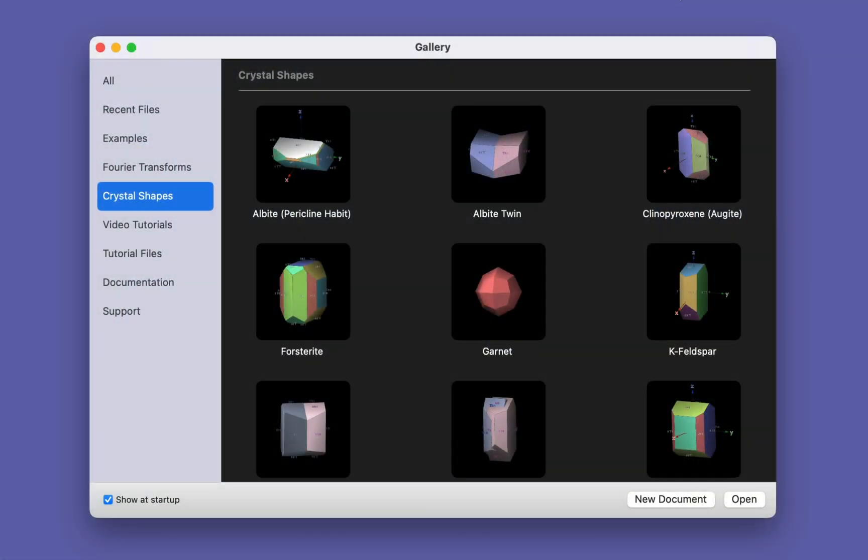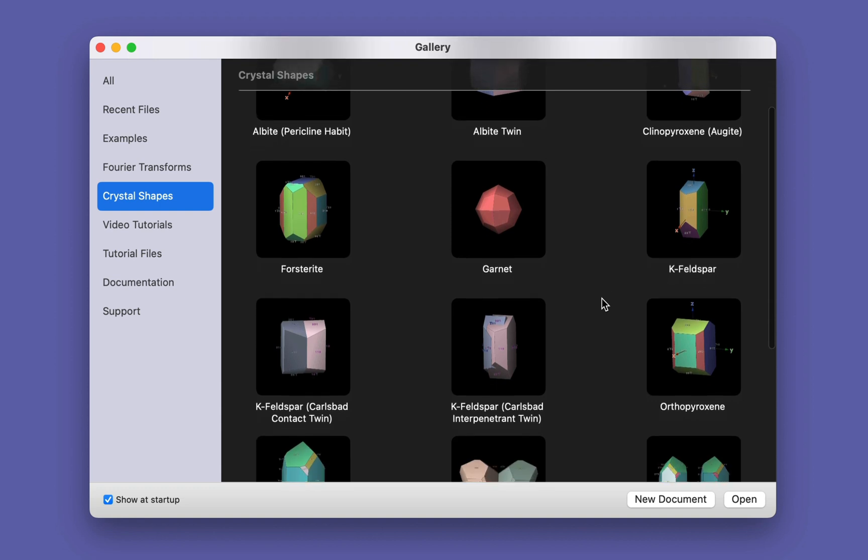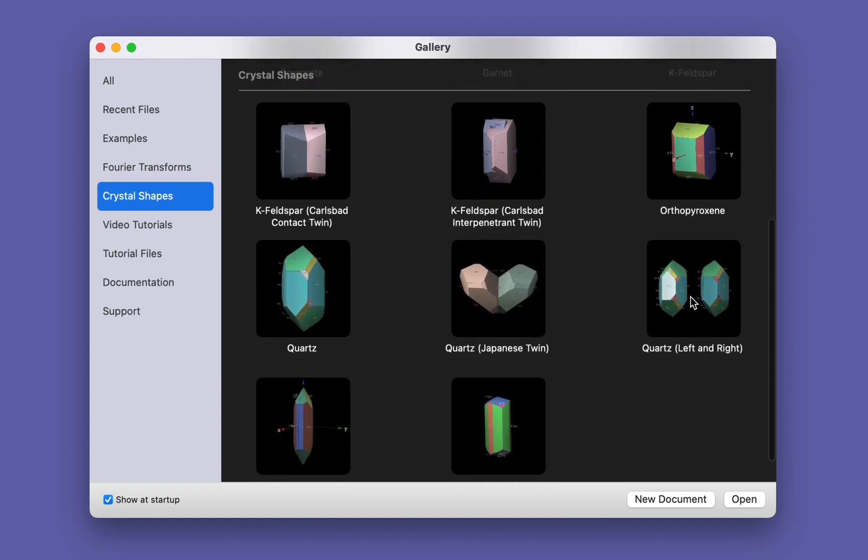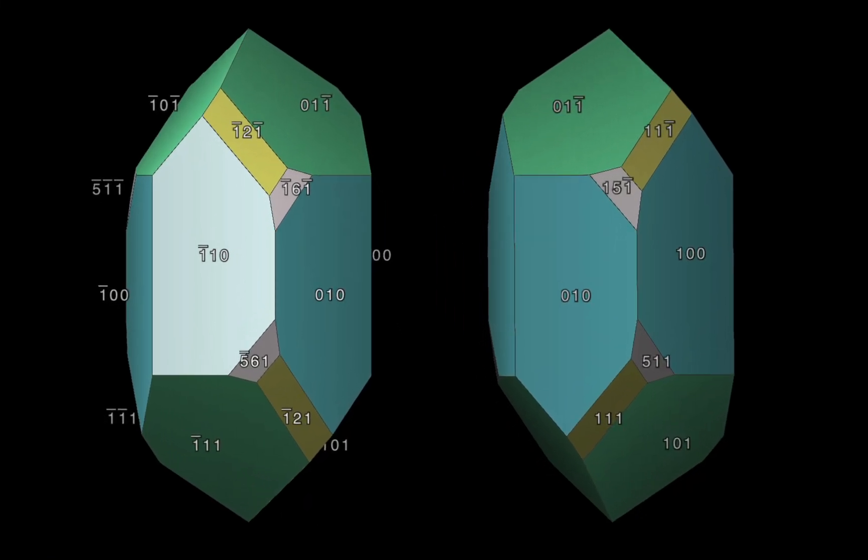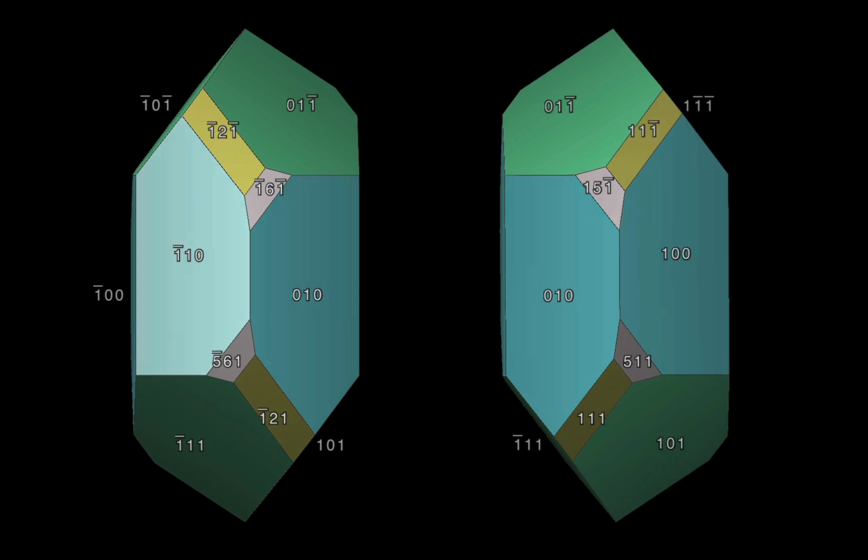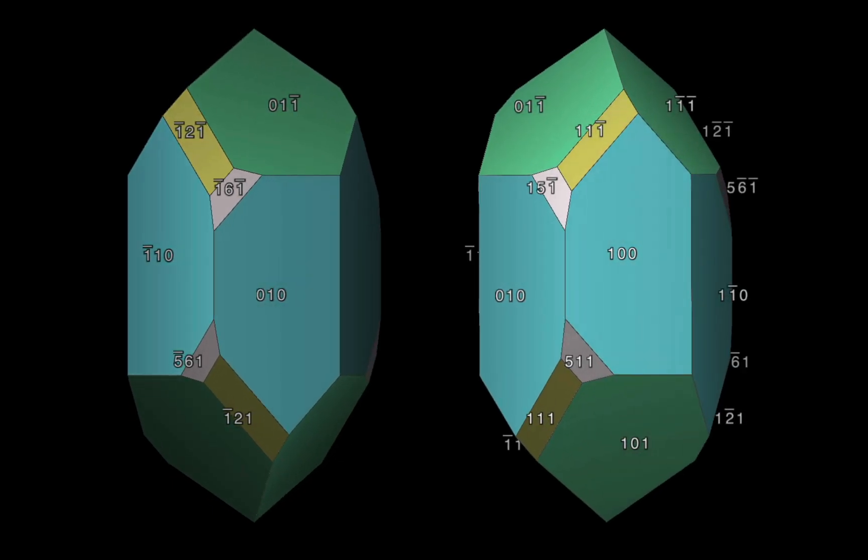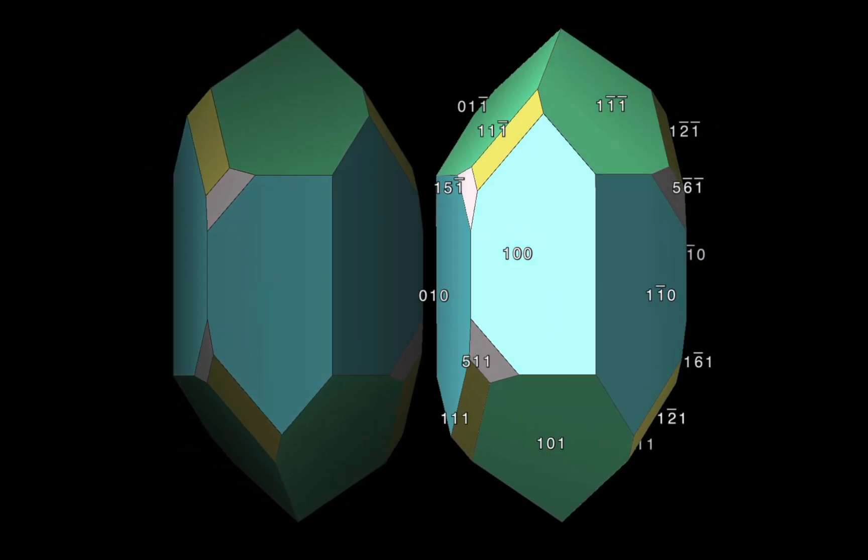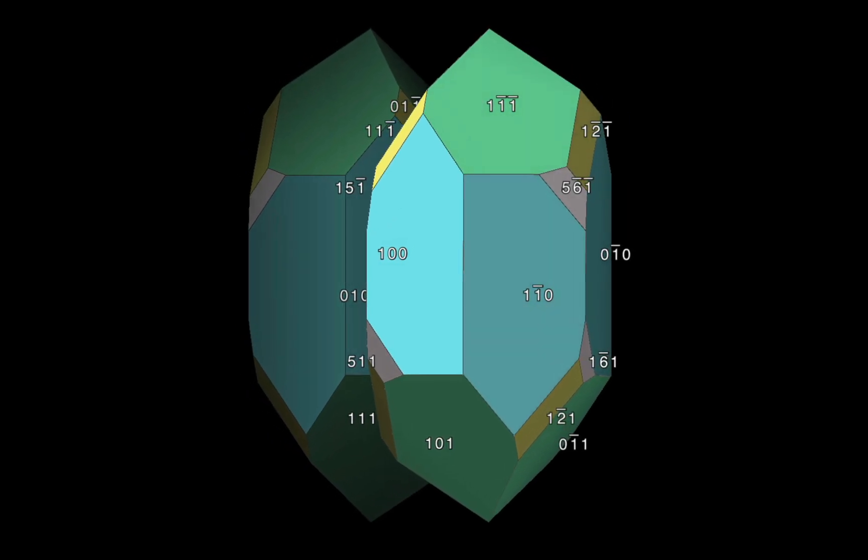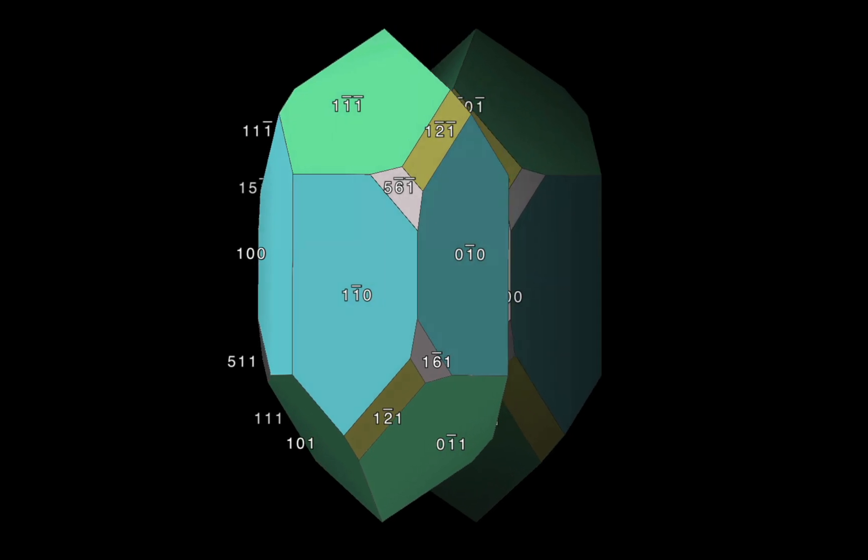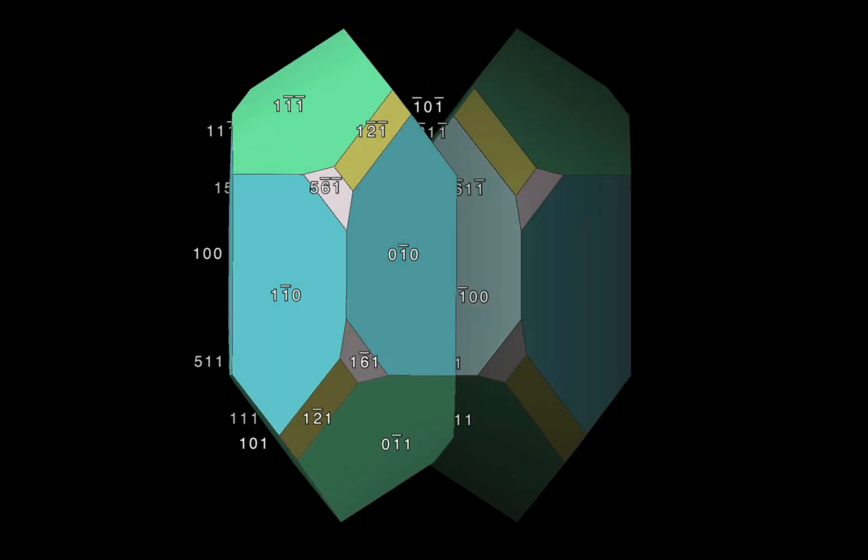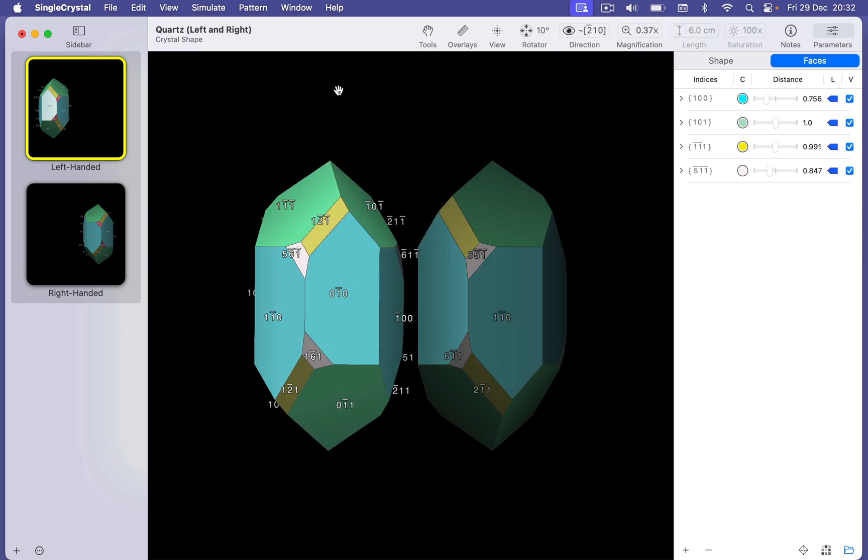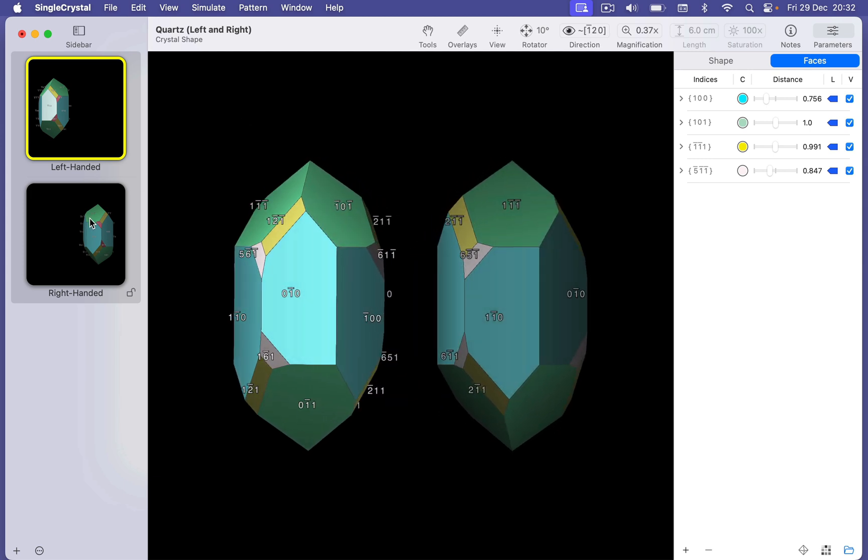Single Crystal's gallery window includes a set of crystal shaped models. Including one with mirror images of quartz. Left and right forms. Because Single Crystal is a multi-pattern, multi-structure program, you can easily have multiple models in the same document. Which is a great way for understanding chiral relationships, such as this one, as well as twinning relationships. You use the patterns or structures in the document sidebar to control the visibility.